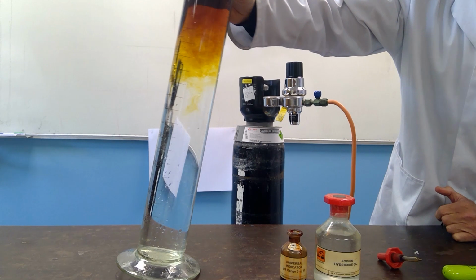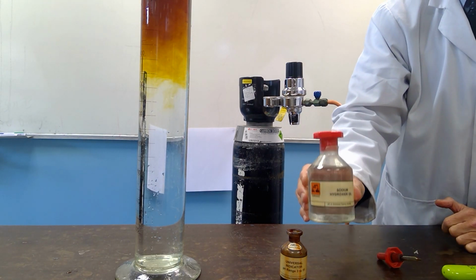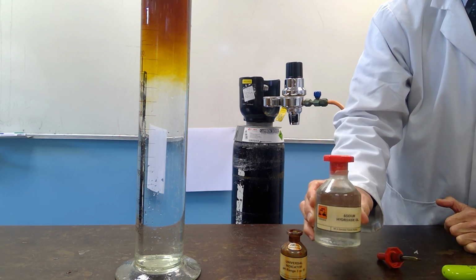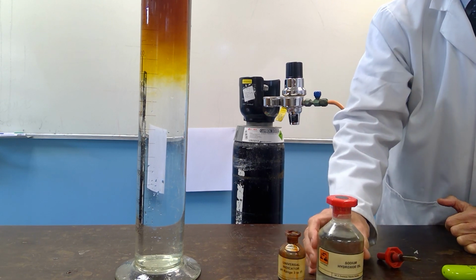The solution can be made to be alkaline by adding in sodium hydroxide. Sodium hydroxide is a strong alkali, and so therefore will turn the color of the universal indicator to its blue color.